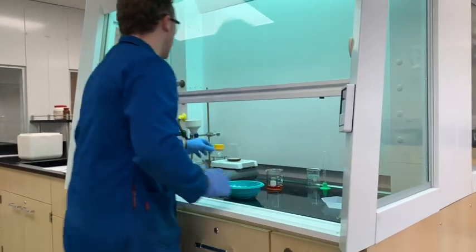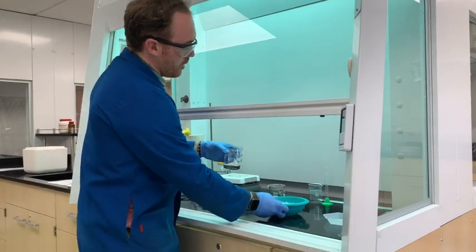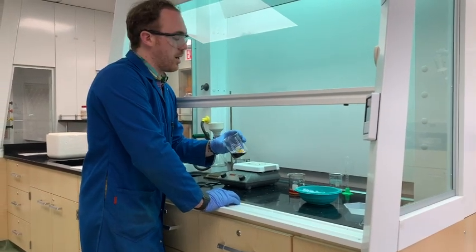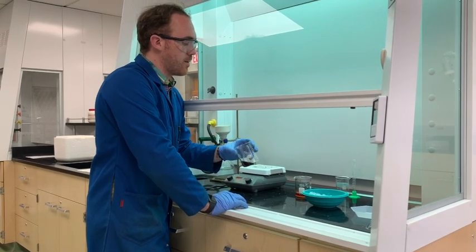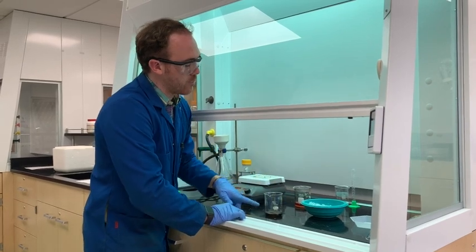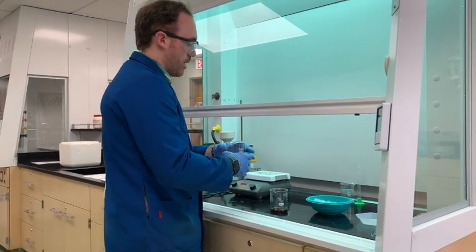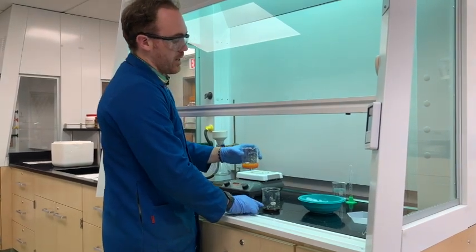And it appears that all of our naphthol has fully dissolved, giving us this brown solution of the 2-naphthol, 1.8 grams, and a little over, I added some more, 10 milliliters of 3 molar sodium hydroxide. So you have this basic solution right here, and that's going to be our nucleophile. And then we have our electrophile in the form of this precipitate salt here. And what we're going to do is combine these two in order to get our final product in this flask.